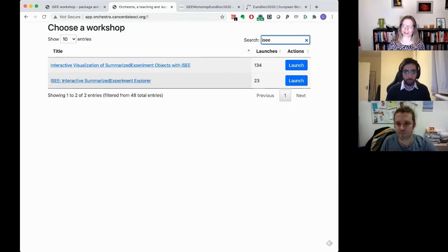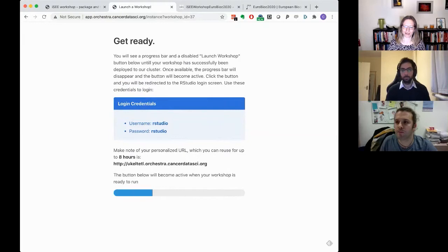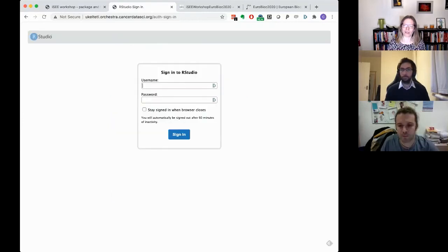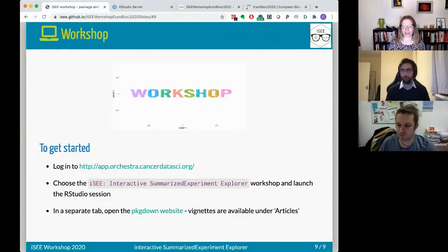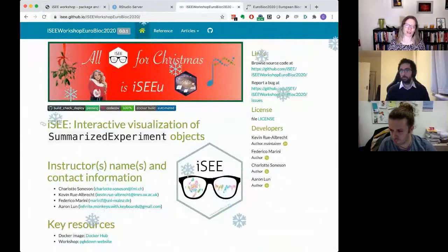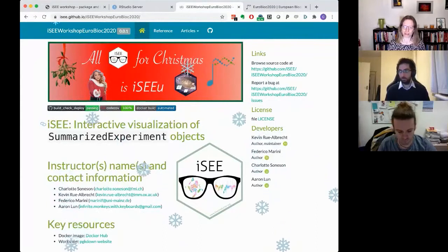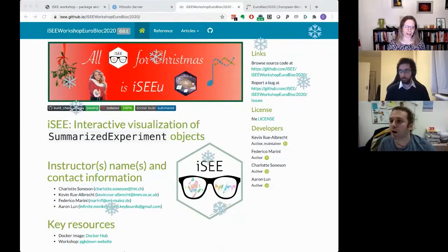Click launch and wait until a button appears. The username and password are 'rstudio'. Then in a separate tab open the pkgdown website, which contains all the information and material we'll walk through. This is just a readme and all the individual vignettes are available under Articles.